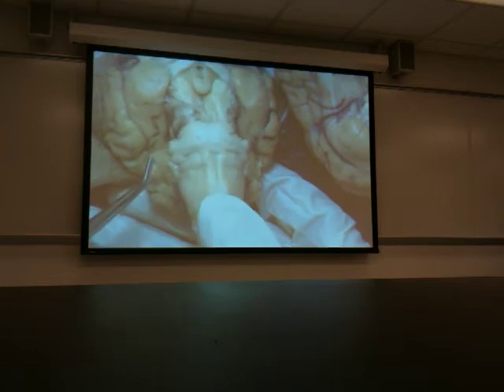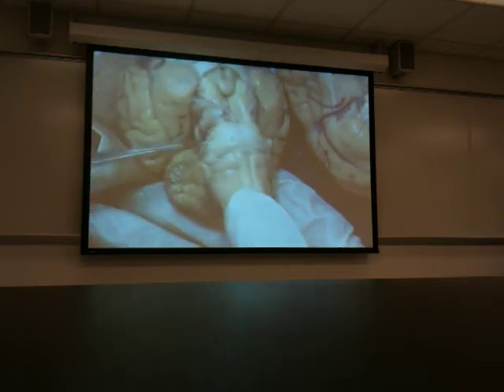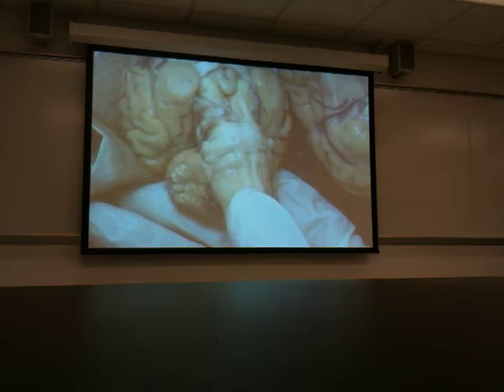You see beautifully here, this is not the beautiful one. Right here, that stump, it's quite apparent. That's the trigeminal nerve. That whole thing. Yep. Now that will trifurcate into 3 branches.